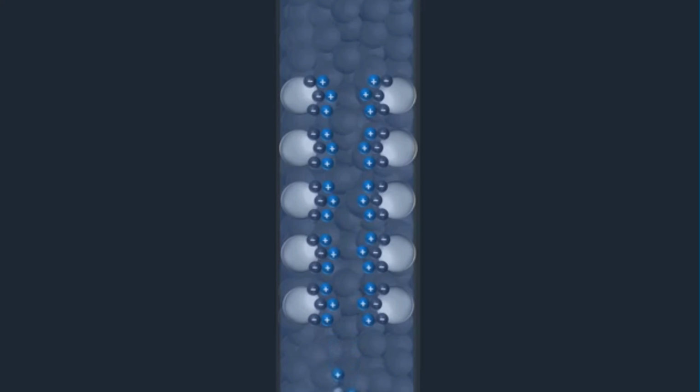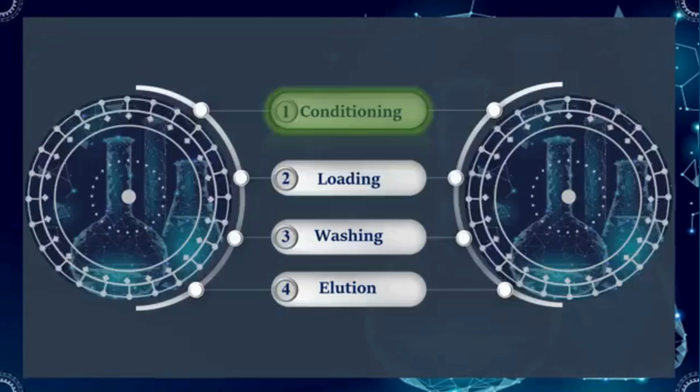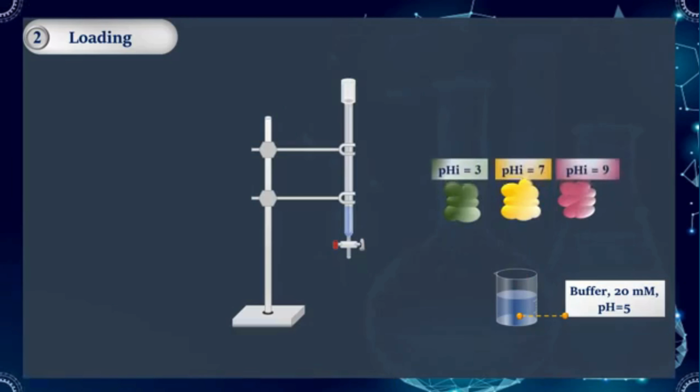Major applications. IEX has an unusually broad analytical and industrial scope. Biochemistry and biotechnology: protein purification, monoclonal antibodies, peptides, amino acids, nucleic acids, and charge variant analysis.